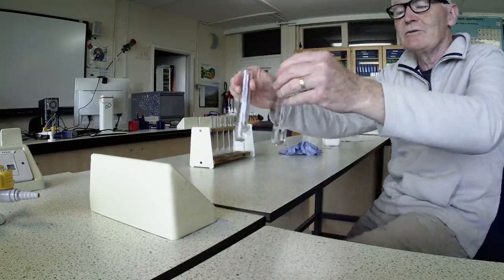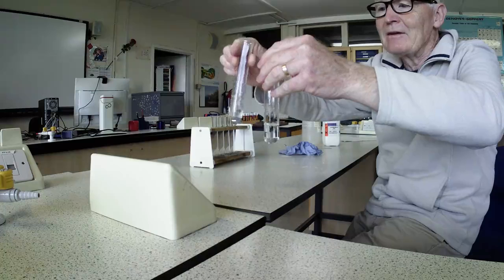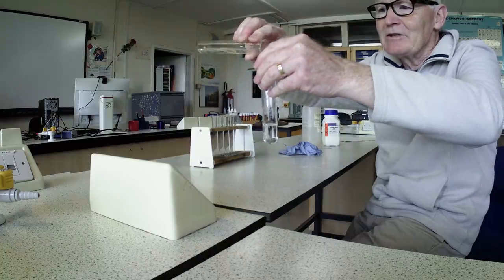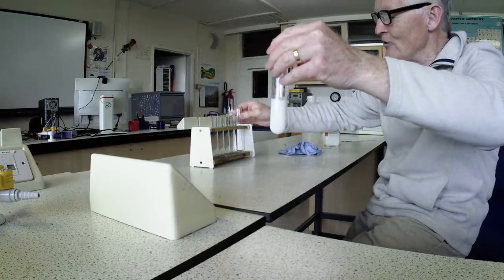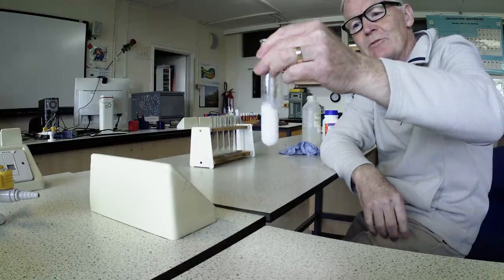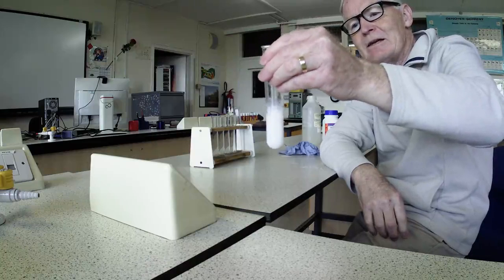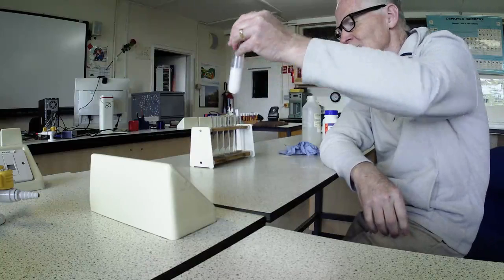So this time we do the same again. We pour the one solution into the other. So here's the calcium nitrate going into the sodium carbonate, and we get something like milk formed. So what has actually happened is we have a solid formed. So that's another thing that lets you know a chemical reaction takes place, is that the state can change.